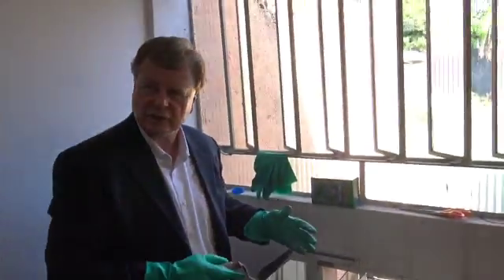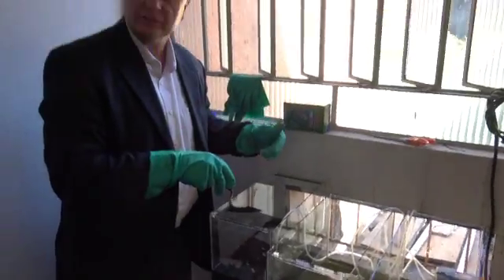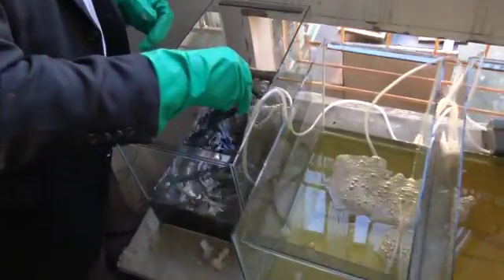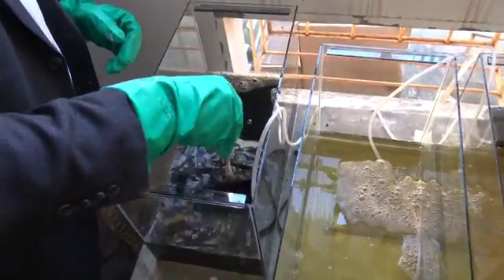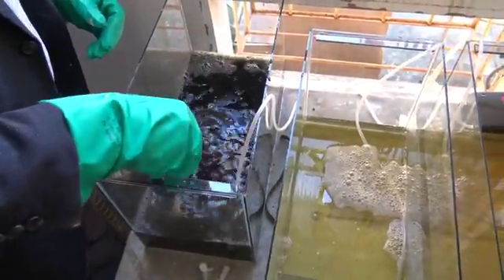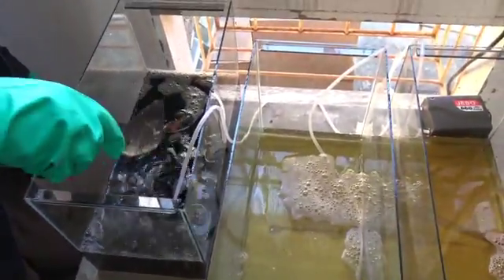What we're going to do now is stir the sediment as if we were injecting OSE II on the bottom of the RIO Bay to see how fast we can break it up and bring it into suspension. It's in suspension.